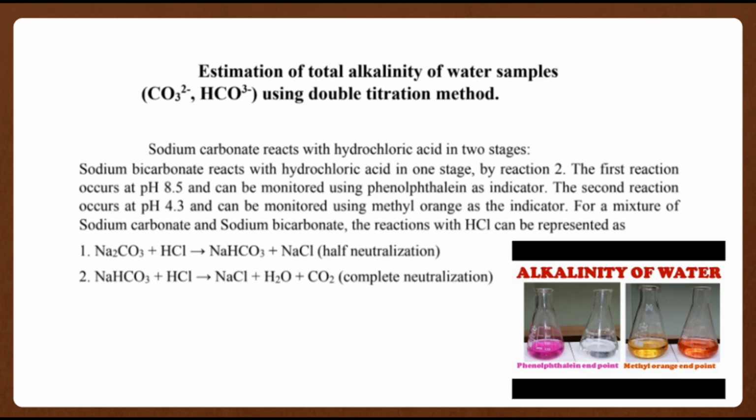The first reaction, which is Na2CO3 plus HCl giving NaHCO3 plus NaCl, which is a half neutralization reaction, occurs at pH 8.5 and can be monitored using phenolphthalein as an indicator. The second reaction, which is NaHCO3 plus HCl giving NaCl, H2O plus CO2, which is a complete neutralization reaction, occurs at pH 4.3 and can be monitored using methyl orange as the indicator.